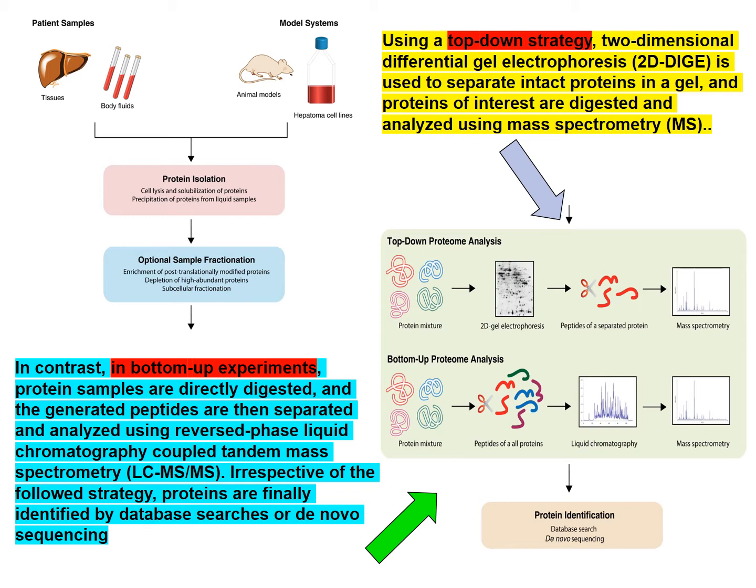So the top-down would find proteins that are predicted or there's evidence for an effect. The bottom-up is you assuming you don't know, and you don't want to miss anything that nobody's predicted before. So that's a subtle difference, but it's a big difference here. Again, you need what people think is there, and then you need to find the unknown unknowns here. What people don't know is there, right? You don't know what you don't know, and that would be in this area. And so we're looking at all proteins.